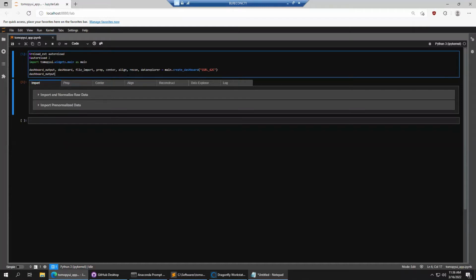If you don't know what you're doing, it's difficult to choose all of those parameters. So what I built is something that people can just go through quickly and visualize their data along this processing pipeline.